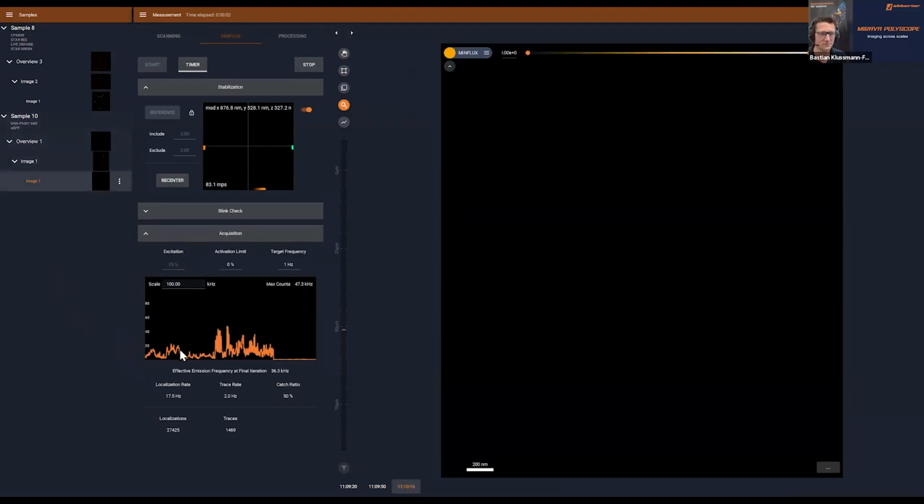And what we are seeing here is basically the detector frequency. So this is the APD detector, and what we are seeing at the moment is the dark noise. But always when we have these larger, broader peaks here, those ones, now the stabilization unit jumped off for reasons unknown. So let's do that again.